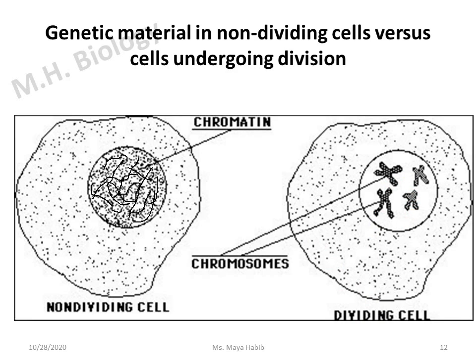Based on this observation, we can now understand why karyotyping is done during cell division. It is simple logic. The karyotype test is done to allow the detection of any chromosomal abnormality, and so, we should be able to see the chromosomes to count them and examine them. That's why a karyotype test is performed on dividing cells. But before going into more details, let us see the different states and aspects of chromosomes within a cell, before cell division and during cell division.